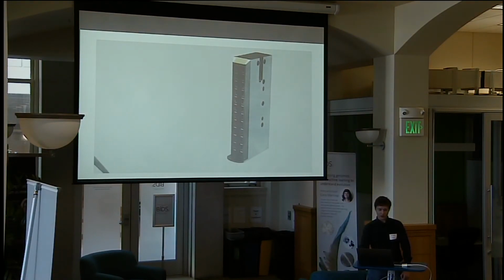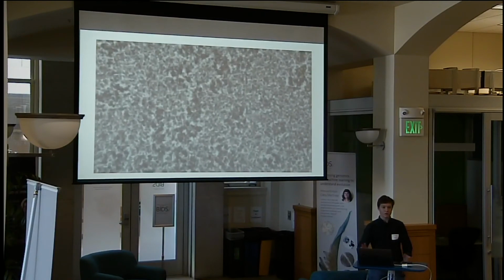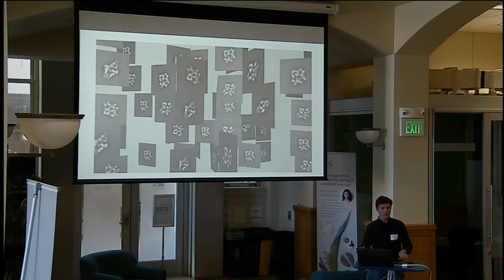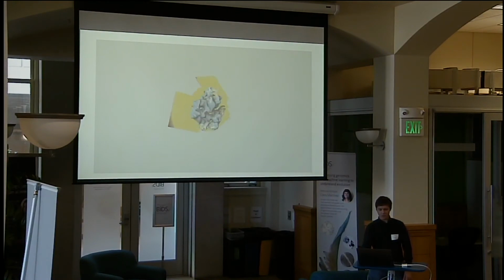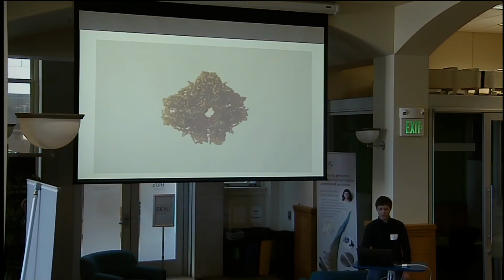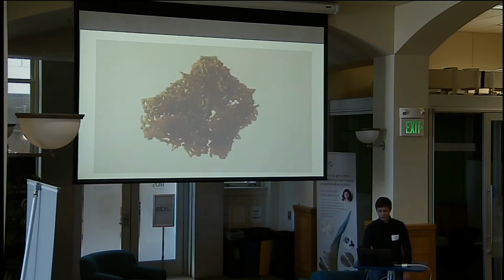During the imaging process, you get many, many copies of the same protein, so obviously you want it as pure as possible, so you get all the same thing, no contamination from other things of the same size and shape. And then you make a composite volume from all of those copies. That's why you need all the different orientations, as you heard earlier this morning.